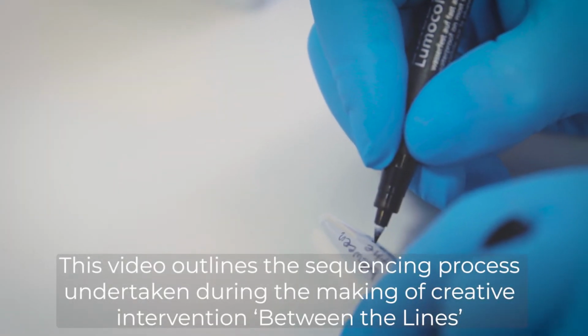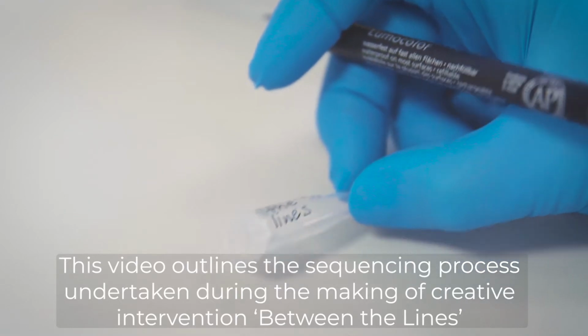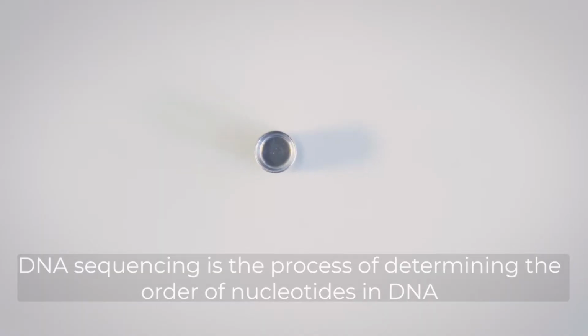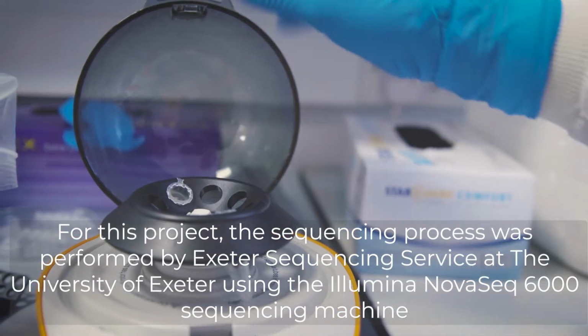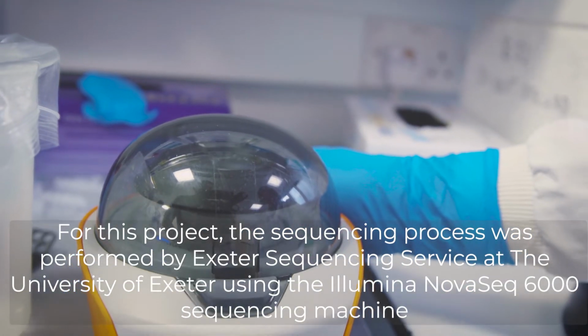This video outlines the sequencing process undertaken during the making of creative intervention between the lines. DNA sequencing is the process of determining the order of nucleotides in DNA. For this project, the sequencing process was performed by Exeter Sequencing Service at the University of Exeter, using the Illumina NovaSeq 6000 sequencing machine.